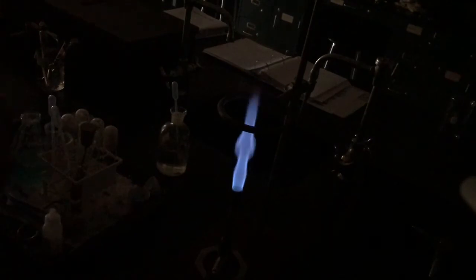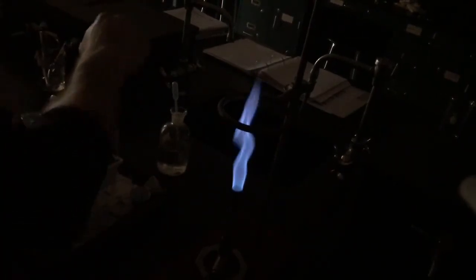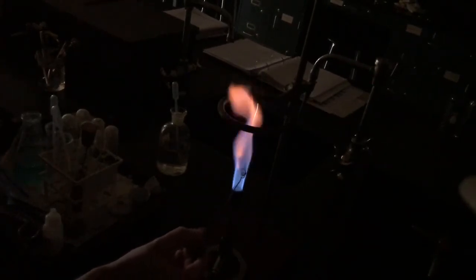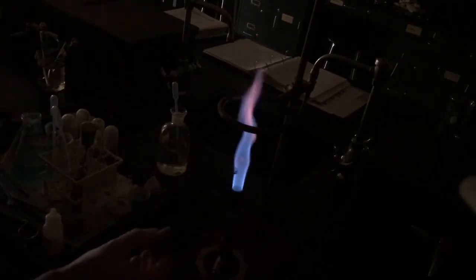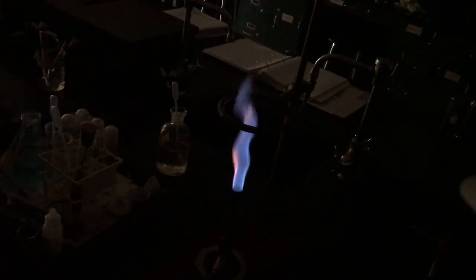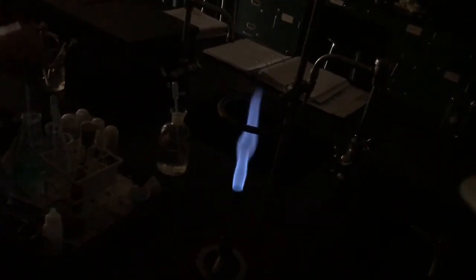Okay, and the last one I want to show you, which is always a really cool one, is copper and how it looks when it burns. So characteristics of copper: Copper 1 is usually a green compound. Copper 2 is usually blue in nature.